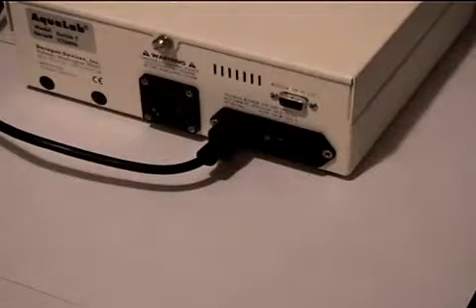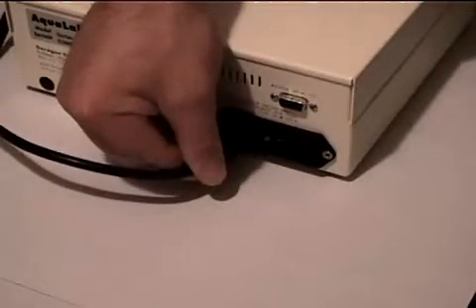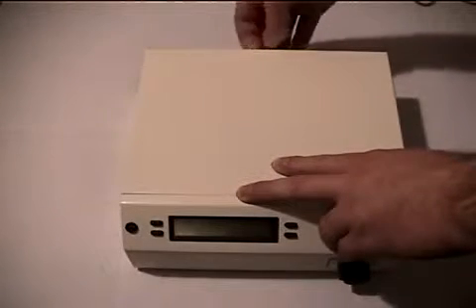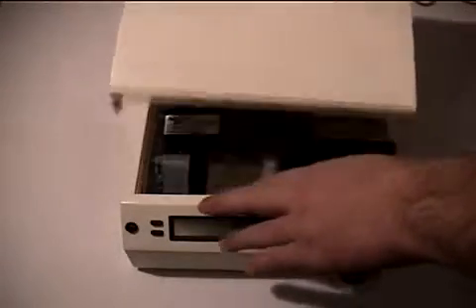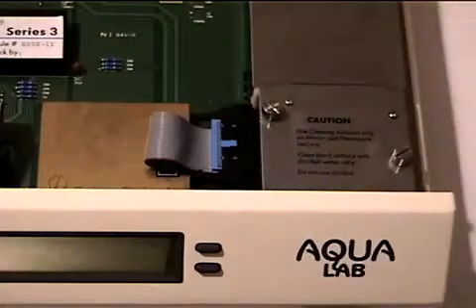Before you begin, remove the power cord from the back of your instrument. Next, remove the lid by turning the thumb screw on the back of the lid counterclockwise and then pulling the lid away from the instrument. Remove the foam cover from on top of the block.